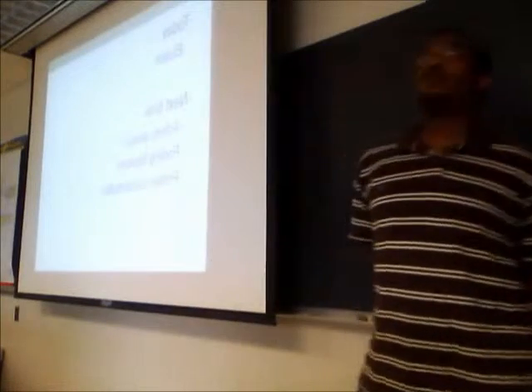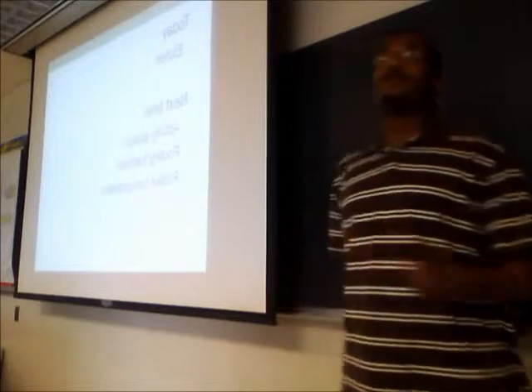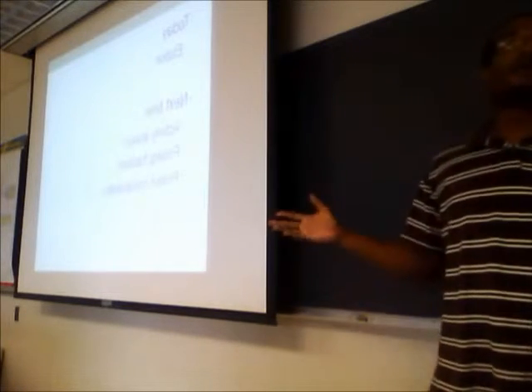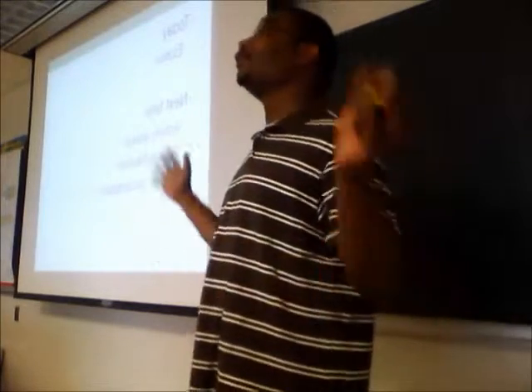We're also going to pool the fractions, and pooling the fractions means that we have the protein of interest that we want, but it's going to be spread out within maybe 5 or 6, maybe 8 fractions. We put those fractions together and we actually concentrate the protein.